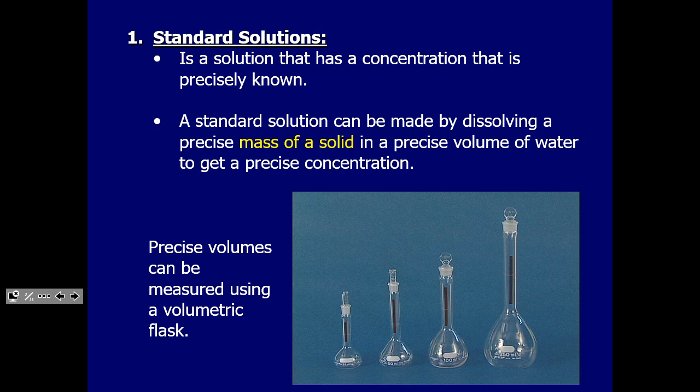all right? So when we create a solution that we know the concentration very precisely, and precisely simply means lots of significant digits, then we have what we call a standard solution.